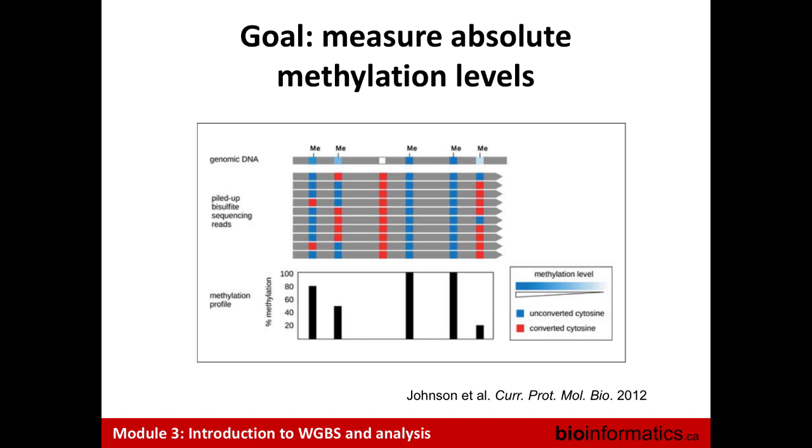If, for example, we see a T on the read. Yes. Well, maybe you're getting into what I have on the next slide. If the reference genome has a C at that position and all you see are T's, this means that they were all unmethylated at this point. But maybe you're getting into what I have on the next slide, which is, what if the reference genome is wrong, and that individual has a T at that position?